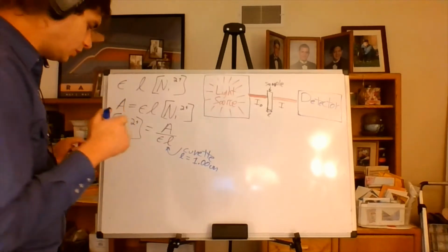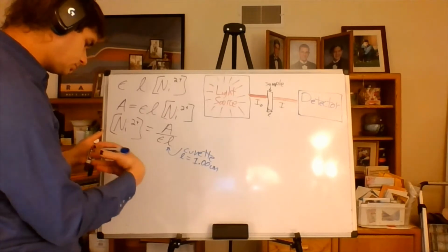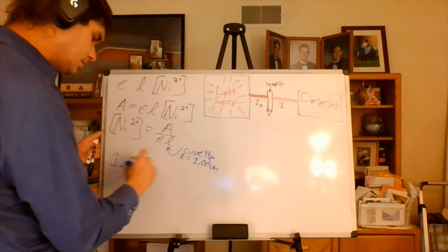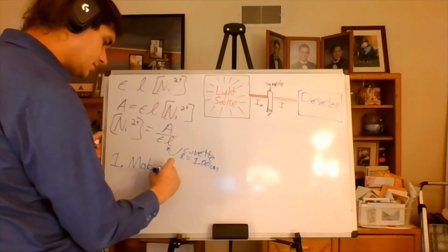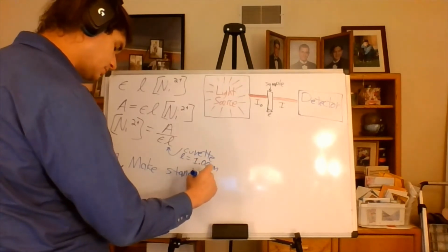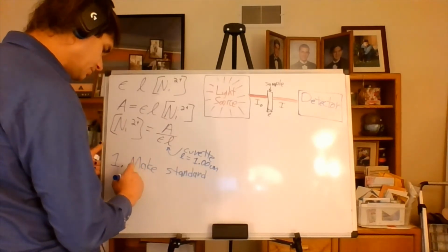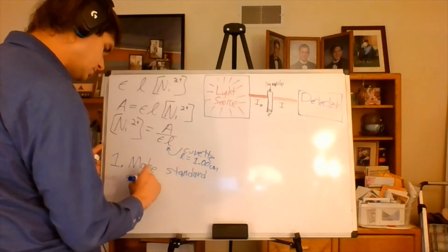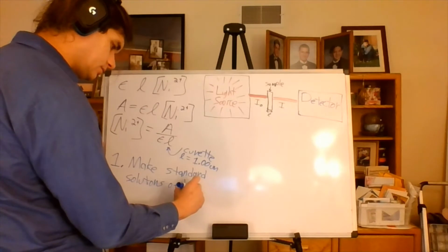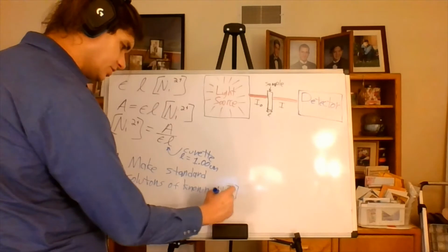So step number one, or I should say part number one, we're going to make standards. Solutions of known nickel concentration.